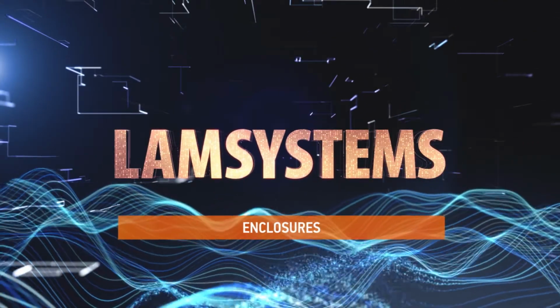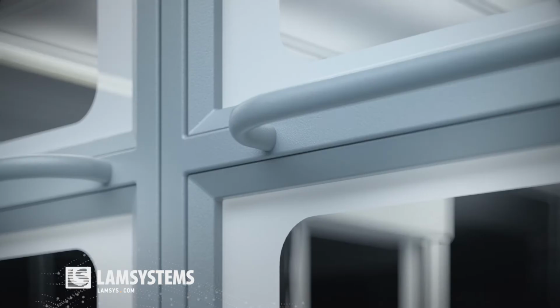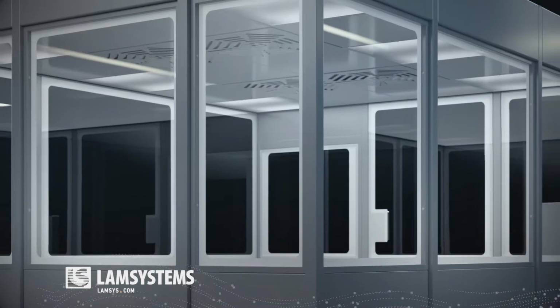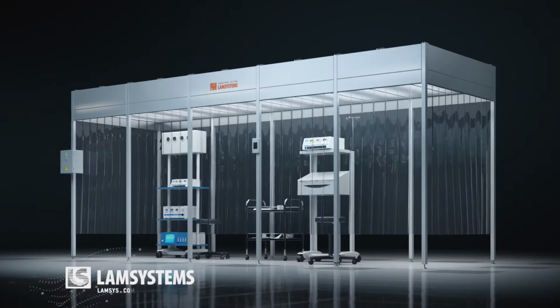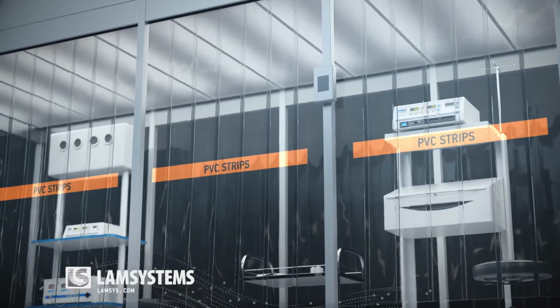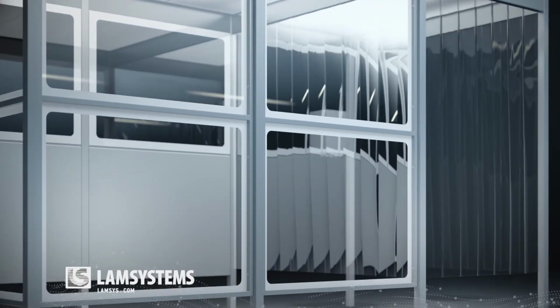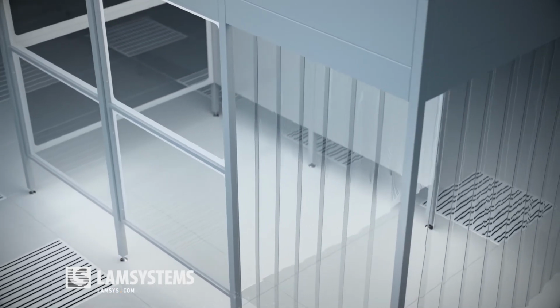Enclosures. Enclosures form the work area of a clean zone and isolate it from the external environment. They are made of metal frame with fixed panels. The panels can be made of tempered glass, coated metal, or a combination of both. Additionally, anti-static PVC strips can be used as an enclosure. In case it is required, a single clean zone can have all types of enclosures. All of them are highly resistant to disinfection and UV irradiation.